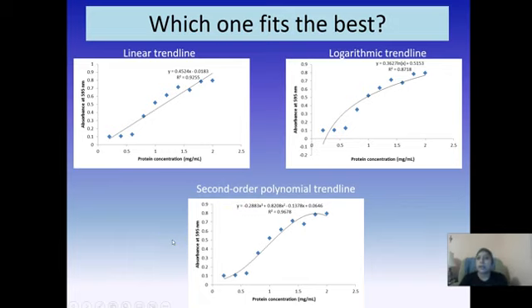So hope that helps and gets you ready for this first exercise. We're going to be utilizing this particular work again and again all throughout the semester with each of the modules, because each module will require us to extract some protein, quantify it, and then examine it in some way, whether it is through PAGE, running it on a gel, running it using an antibody by Western, or quantifying it through ELISA. So it is a very important skill that we want to make sure everyone gets in this first week.